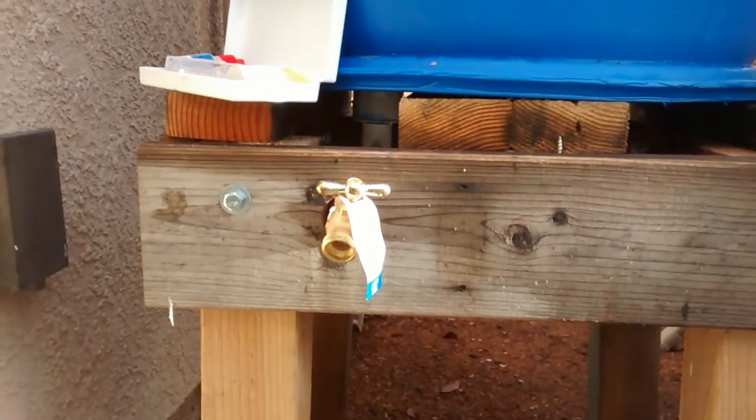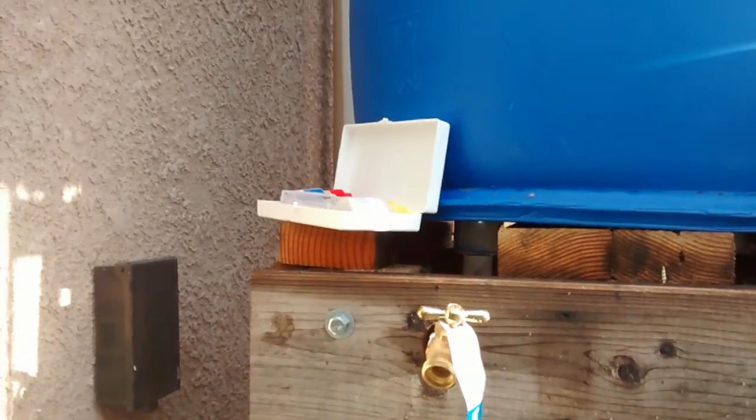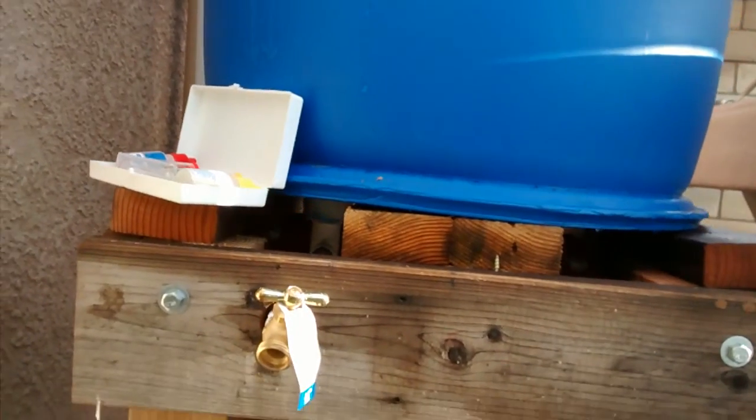So here's the spigot. You've already seen my other video. That is my rain barrel and that's basically it. So here is the spigot.